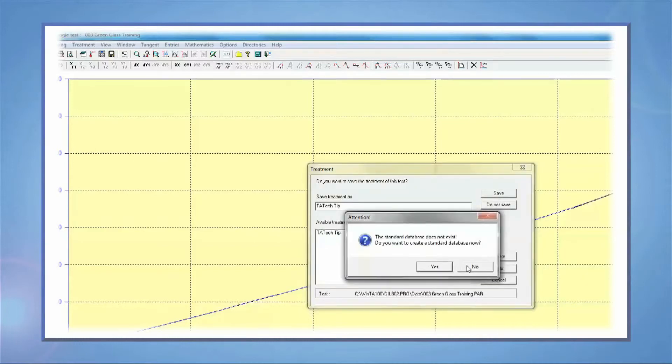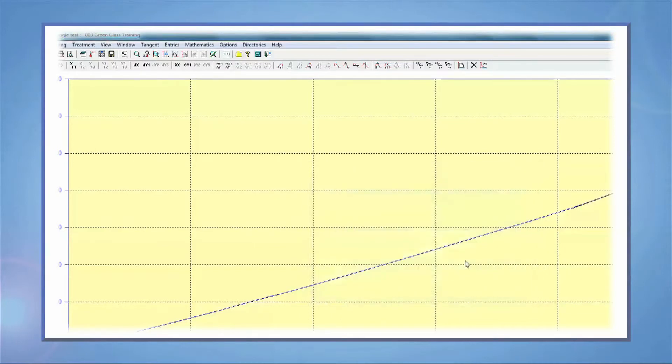These are just some of the options available using WinTA software. In this TA Tech Tip, we learned how to analyze dilatometer data. Please stay tuned for more Tech Tips from TA Instruments. Thank you for your interest.